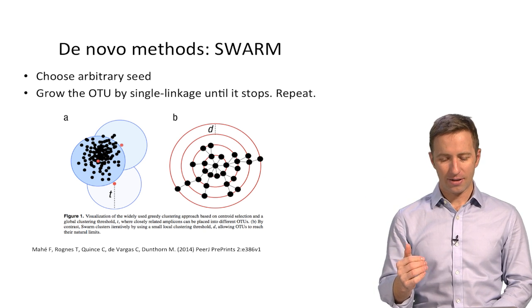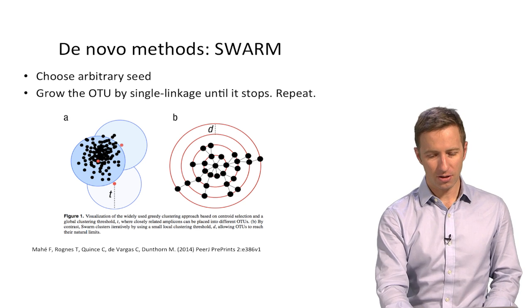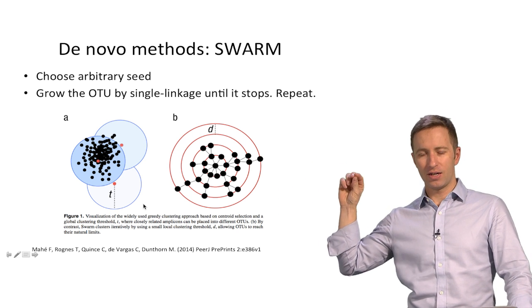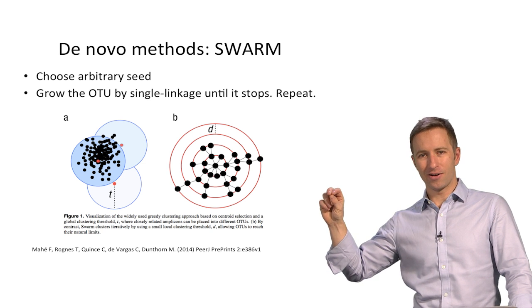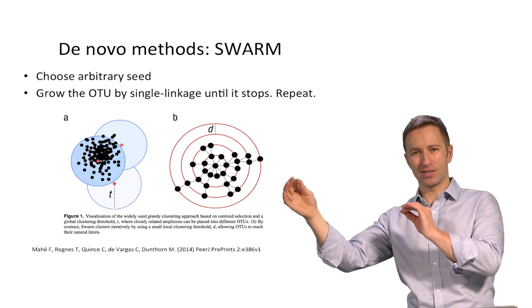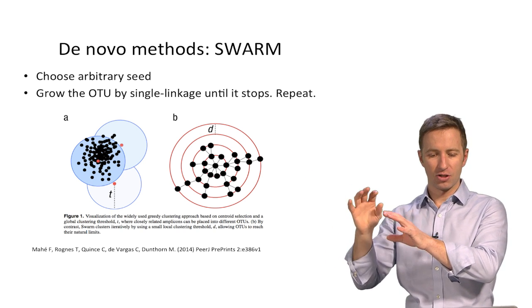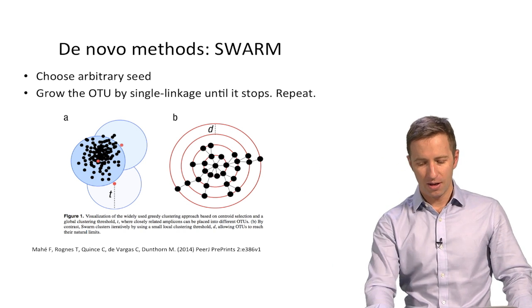In addition, because it's single linkage, you won't get the case shown on the left side, where you can have centroids in one cluster that are very close to another cluster, but happen to fall just outside the threshold for being included in that cluster. So you end up with basically false clusters, like too many small clusters.